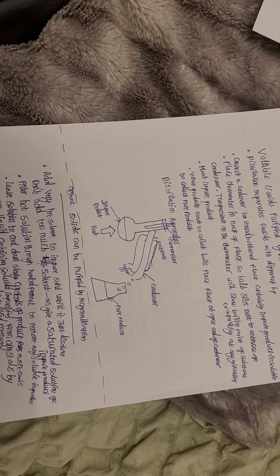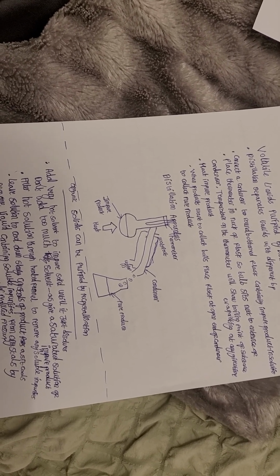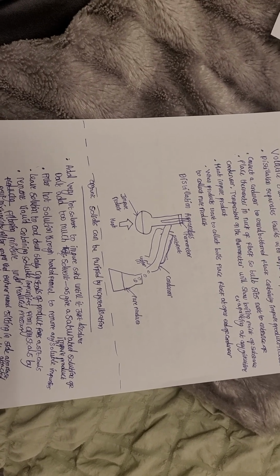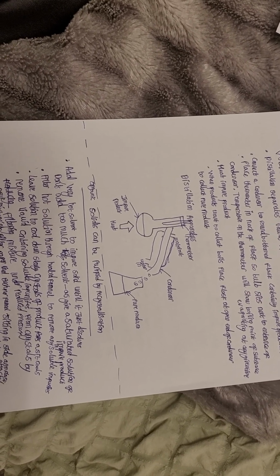Organic solids can be purified by recrystallisation. We want to add a very hot solvent to the impure solid until it just dissolves. The reason we don't want to add too much hot solvent is that it will not give a saturated solution of the impure product. So don't add too much hot solvent. And this is how organic solids can be purified by recrystallisation.